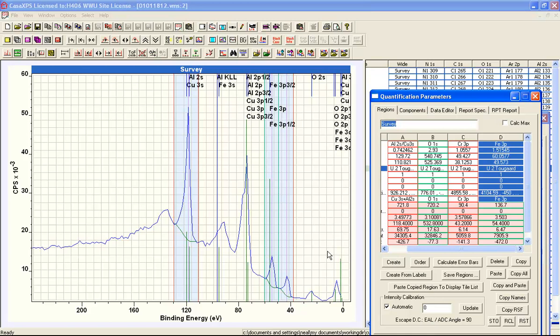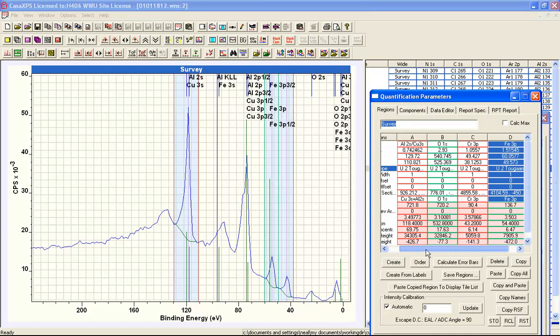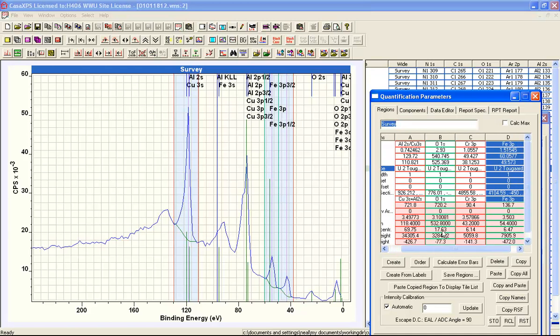We're using RSFs that are Schofield cross sections modified for the angular distribution correction at 90 degrees — since this is an analyzer/x-ray source angle of 90 degrees, p orbital values are adjusted accordingly. The quantification is also corrected for the effective attenuation length, i.e., the escape depth correction, assuming a bulk-type material.